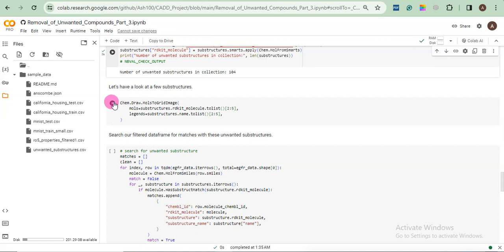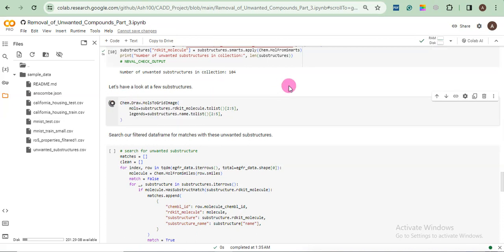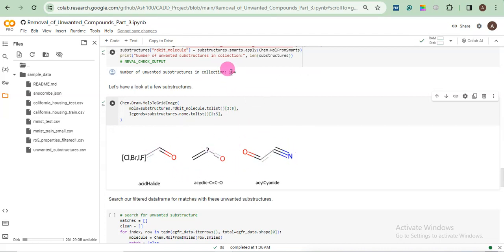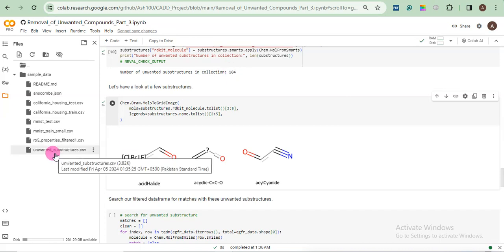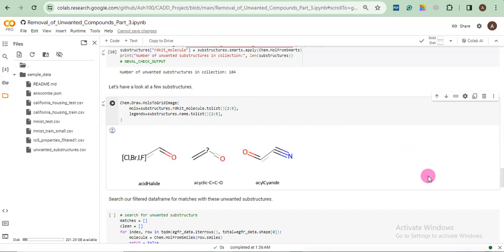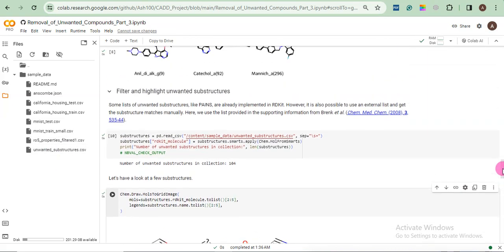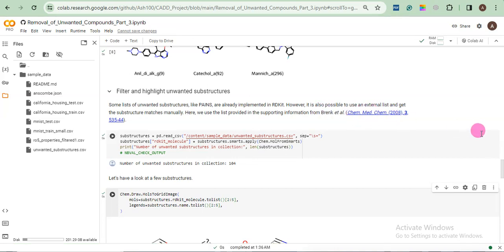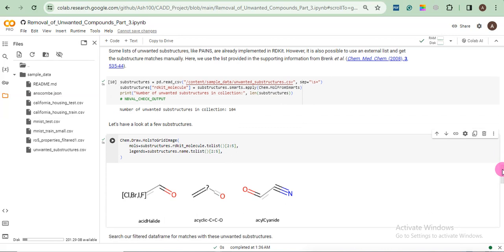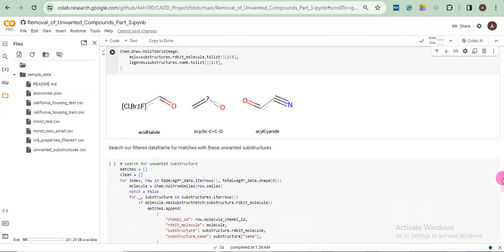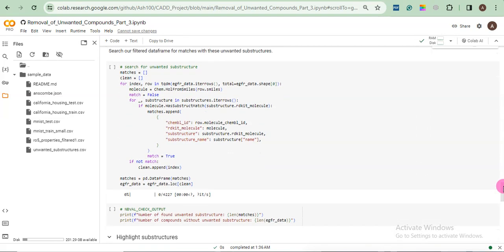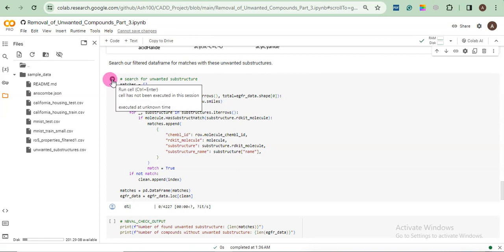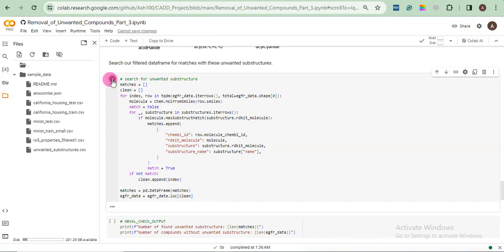Okay. Now we will look at some substructures from the data. You can see. Okay. But remember, these substructures are present in this data which we uploaded and which was collected in this publication. So you can also collect it from there. Doesn't matter. Okay. Now we will search our data for the unwanted substructures.